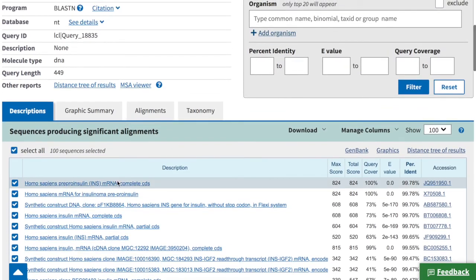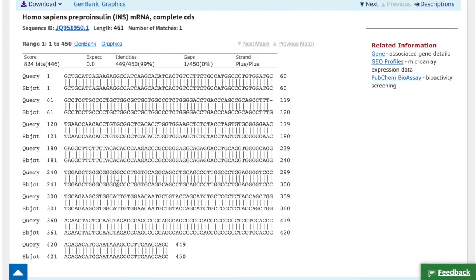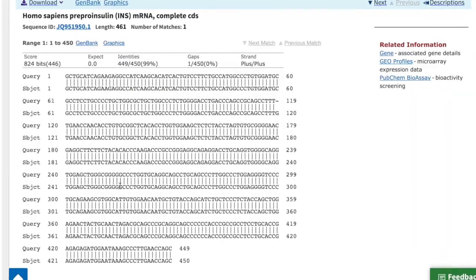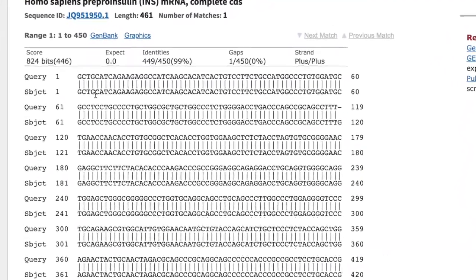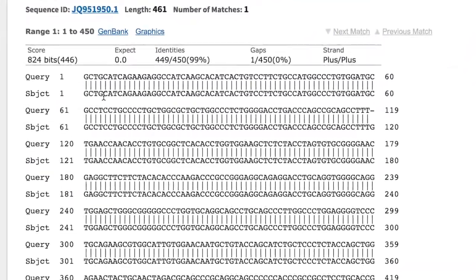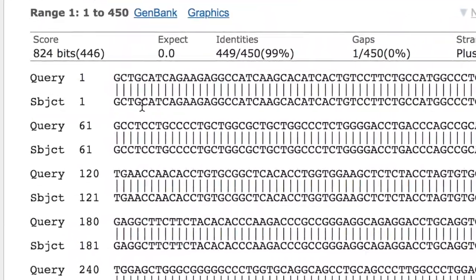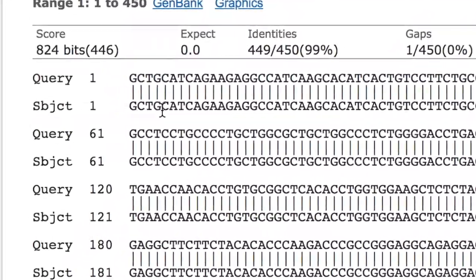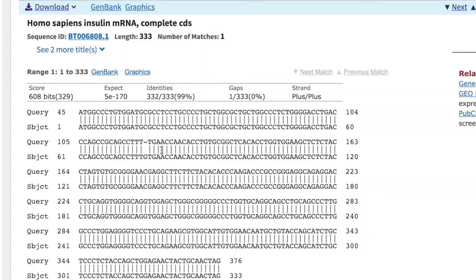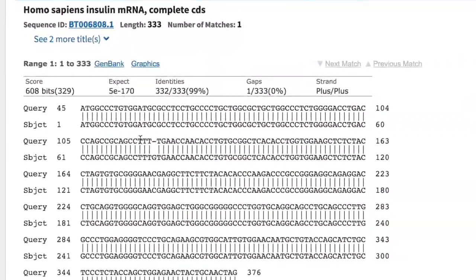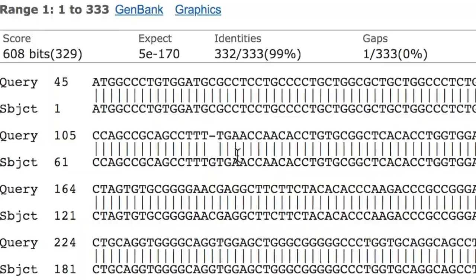If you click on any of the matches, it opens a new page that looks like this. The sequence you entered into the search field and the sequence from the database are stacked on top of one another to allow you to compare them. A vertical line between the two strands shows a perfect match or a perfect alignment. If you don't see a vertical line in a particular place, it means that the two strands differ in that location.